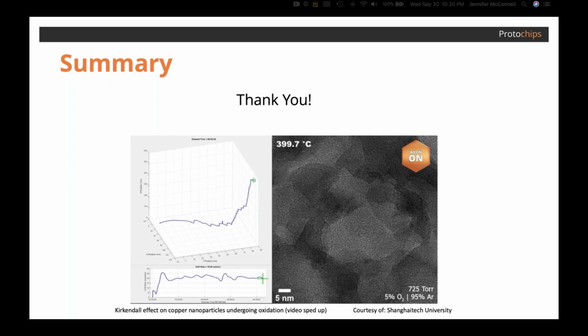On a separate NIC, network interface card, within AXON, that's the part that interfaces to the internet and the outside world. The benefit there is that you can share a screen that has the live view from the camera or STEM detector, as well as the experiment data, through the AXON core without needing a direct internet connection to the TEM or the camera computer.